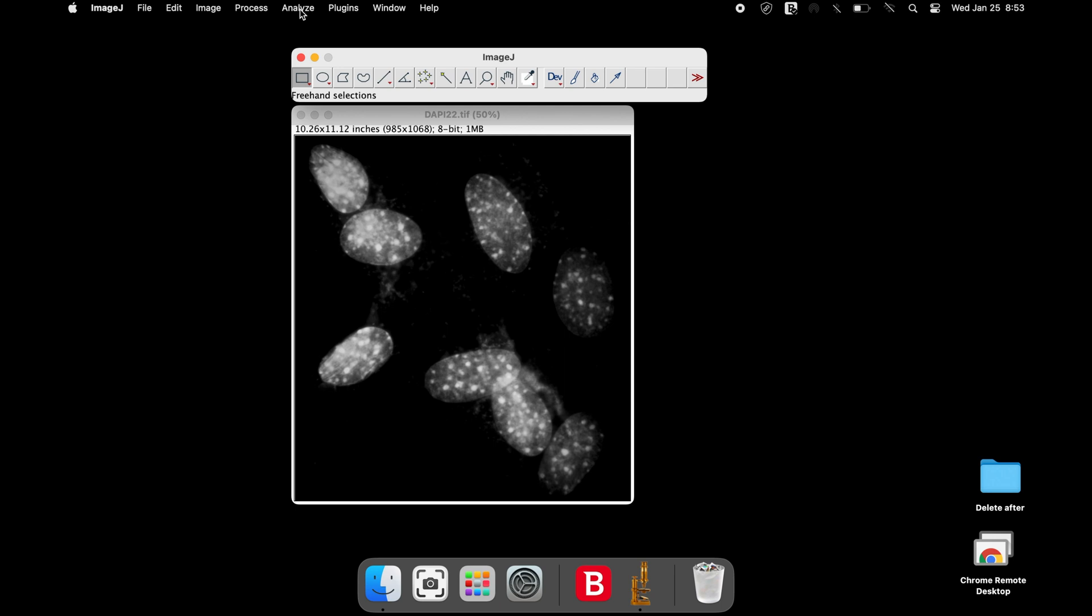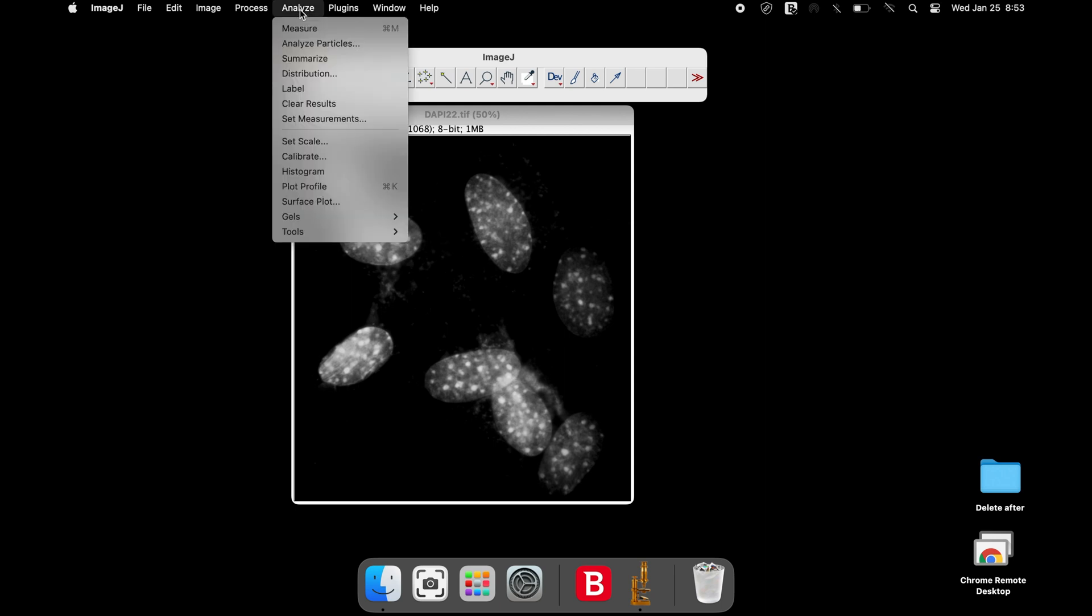To convert the image to a surface plot, click on Analyze and Surface Plot.